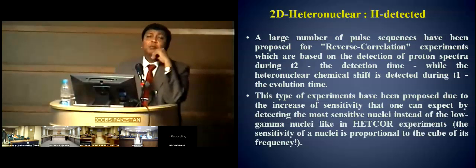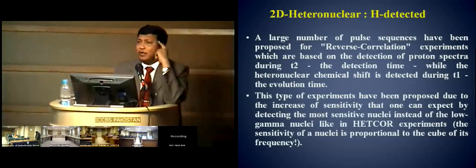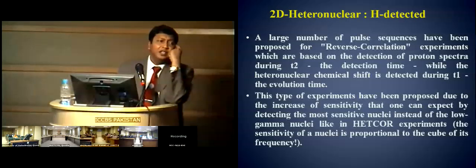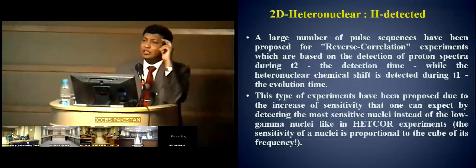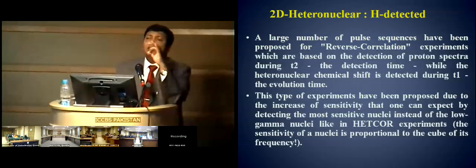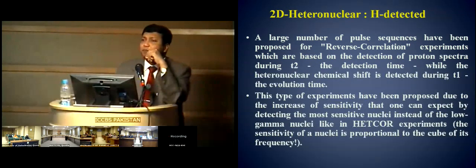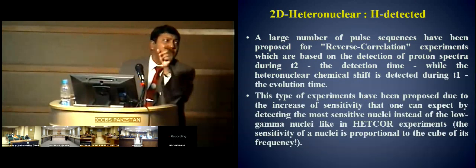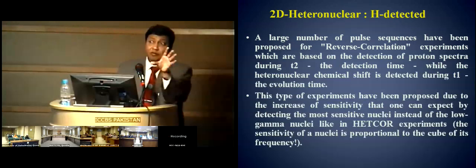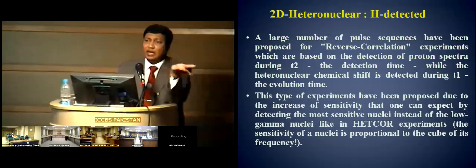You also learned an extremely important factor: because of the presence of proton, 2 sets of carbon appear in the negative phase and 1 or 2 sets appear as a positive phase. So what we have learned, an amazingly important observation was made at that time, that although you are detecting carbon, information of proton is visible in it, isn't it? Some information about the proton, not everything, is detected through carbon.